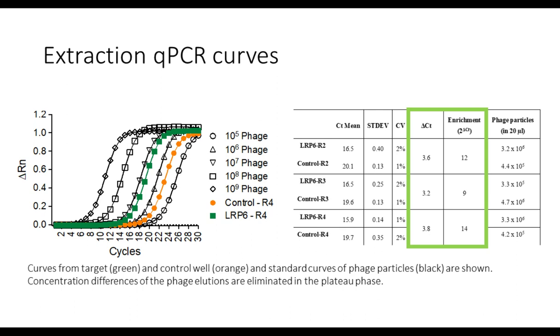So this is the data that we saw, and we've done that for every round. And although we already saw enrichment in the first round, so we probably could have theoretically stopped here, we continued and we reduced the amount of bait of target protein. And at some point, we just reduced it too much, and we didn't see that much enrichment anymore. However, we took round 4, but for this case, you could have already stopped at round 3, and we also analyzed these reactions.